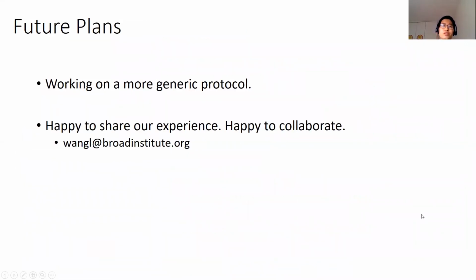So here's our future plans. One thing is, as we have demonstrated, the two protocols I demonstrated are both customized to our own needs. If we got a new collaborator and they want to use our platform, right now it's not gonna work, because their protocol tree in SynchroPatch might be different, and it might not support that.